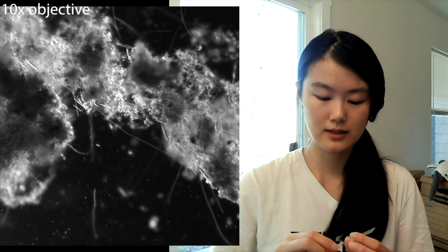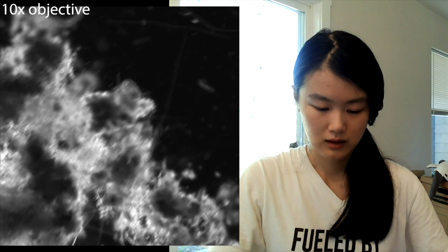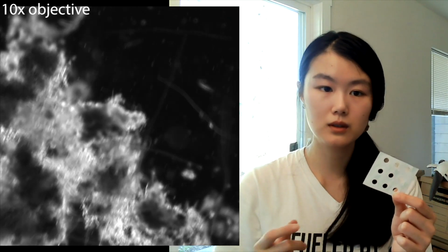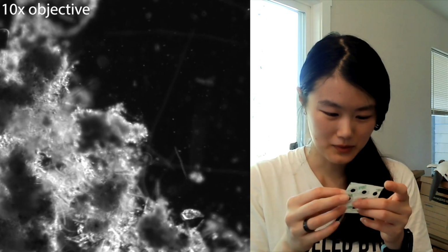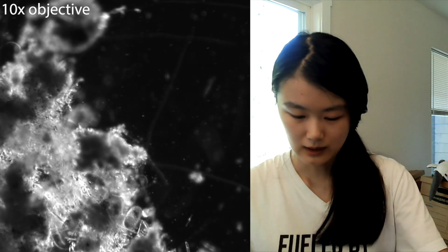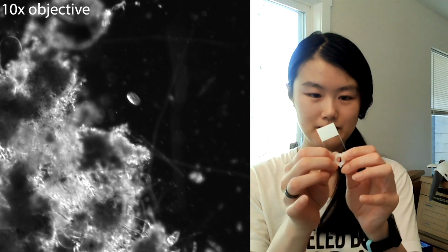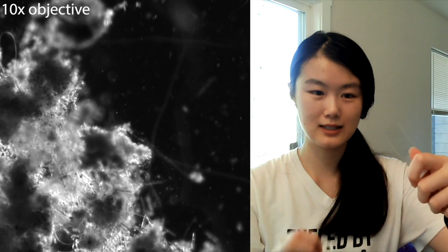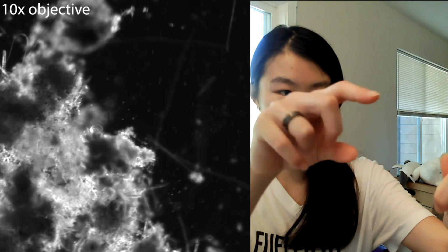There are many ways to prepare samples for Foldscope. The way I'm gonna do it is I'm gonna take a glass slide and one of these stickers that comes with the Foldscope. When you build the Foldscope, you only need one of these stickers, right? So you have 8 left. I'm gonna use this sticker to make a well on my glass slide, right? So here's a glass slide and I'm putting the sticker on. So now I essentially have a raised surface where I can put the sample inside.